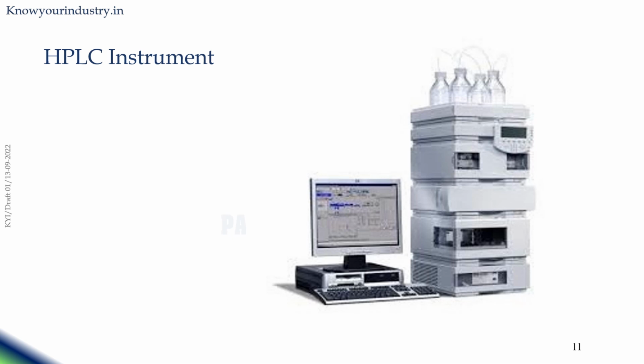This particular slide shows a typical image of an HPLC instrument. In this instrument, you can see the mobile phase reservoir kept above the instrument, and other parts of the instrument are compactly arranged within this setup, and there is a computer system associated with the instrument also shown in the image.